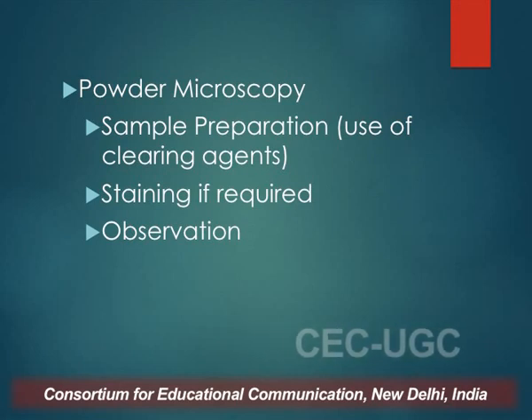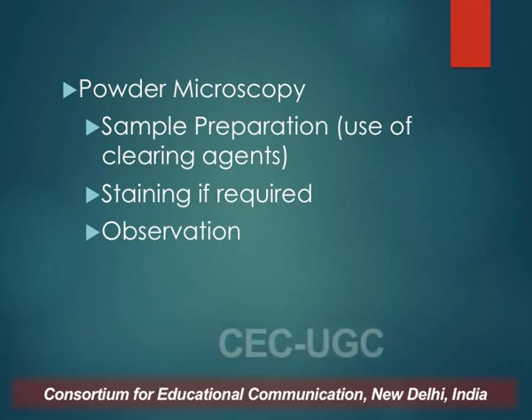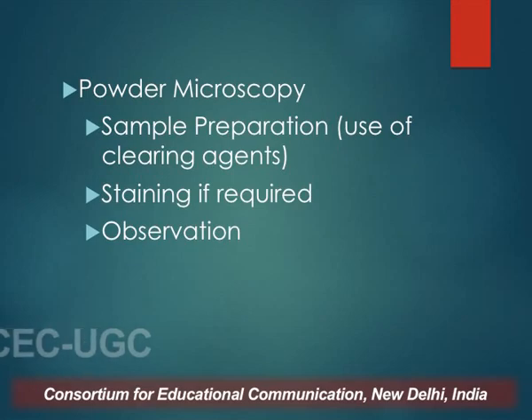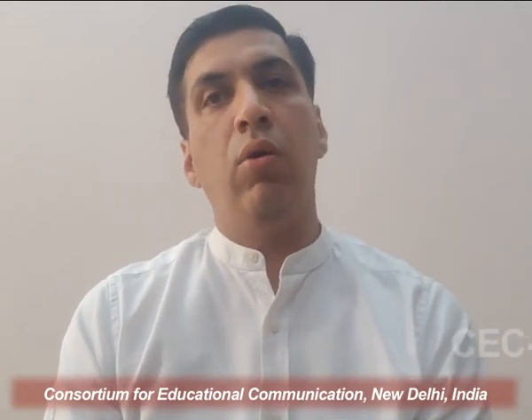Now in case of powder microscopy, hydration as well as decolorization or clearing of the sample goes simultaneously, and for that we require certain reagents which we call clearing or decolorizing agents. These are chloral hydrate, lactochloral, lactophenol, or sodium hypochlorite.